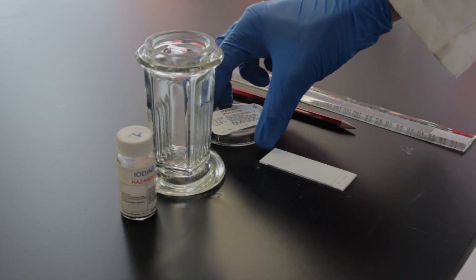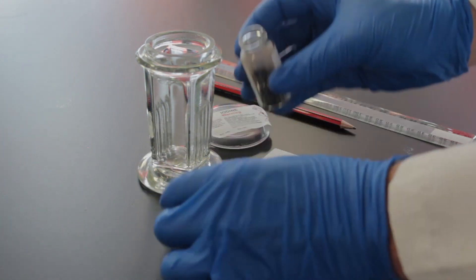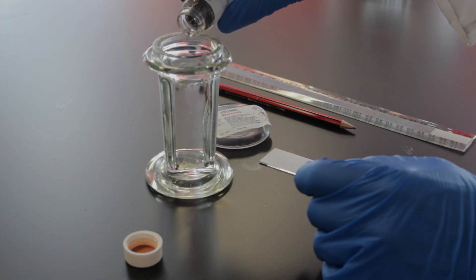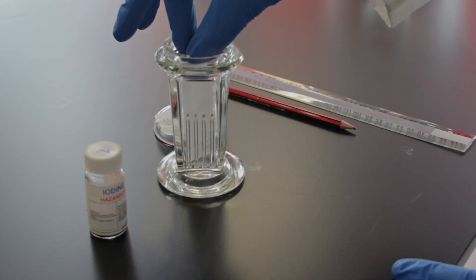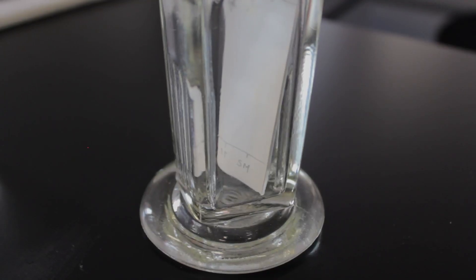Since our samples are white, we can't really see anything on the plates, so now we have to develop them with iodine to stain the spots. First put a few iodine chips in the iodine chamber, then pop in your TLC plate and put the lid on. The iodine chips will release iodine gas into the chamber, which will then colour the spots on the TLC plate. Leave it to develop for a few minutes.